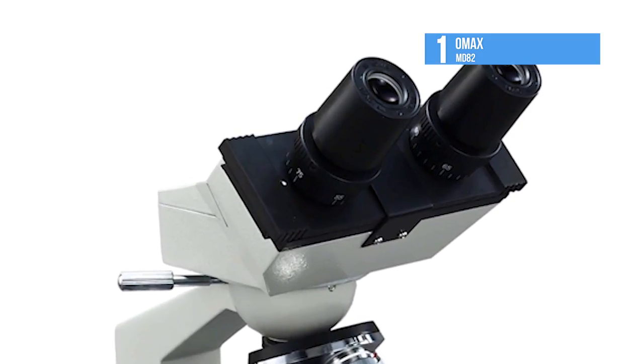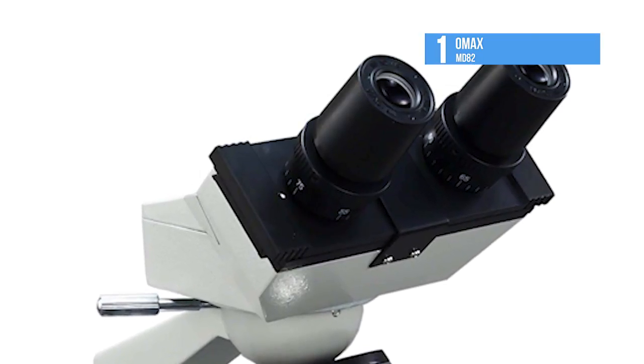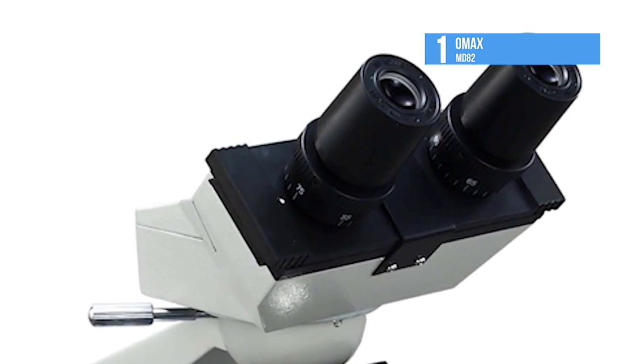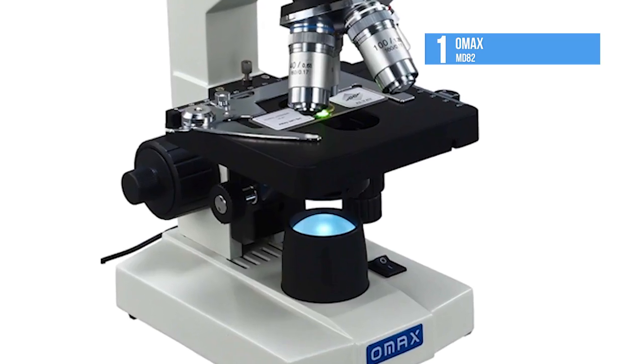It is easy to mount an electronic eyepiece for capturing images and live video on the computer. A darkfield condenser can also be added to switch a brightfield microscope to a darkfield microscope.